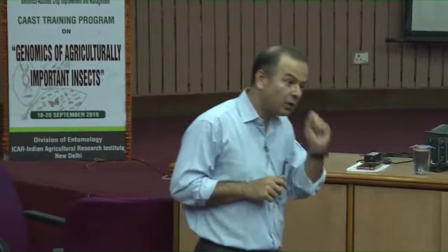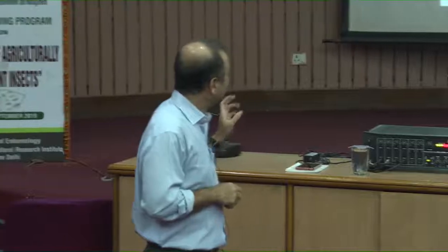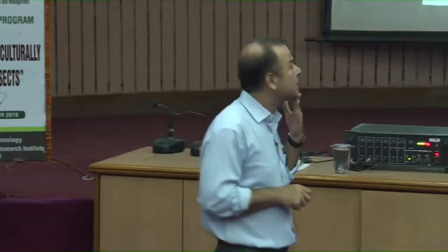Now there is one more term. You may raise a question: sir, you are always talking about fold difference, that it is 4-fold more here, 2-fold more here. How do I find the absolute amount? Can't I say that at the beginning I had this many nanograms of DNA? Yes, you can say, but then you have to prepare a standard curve.